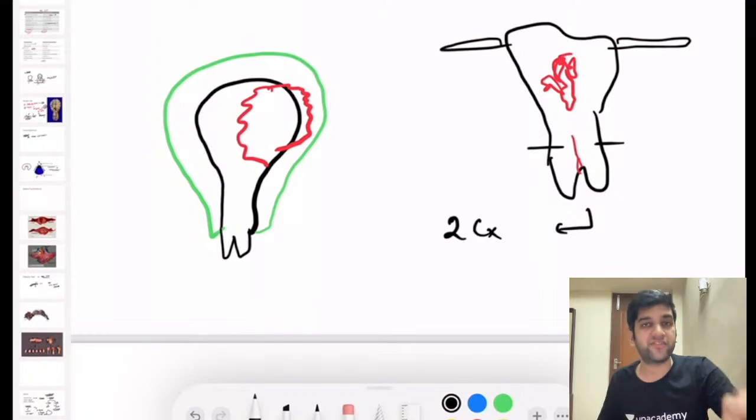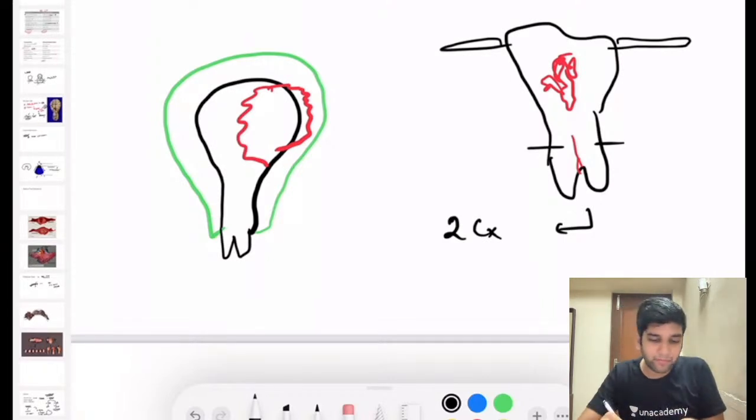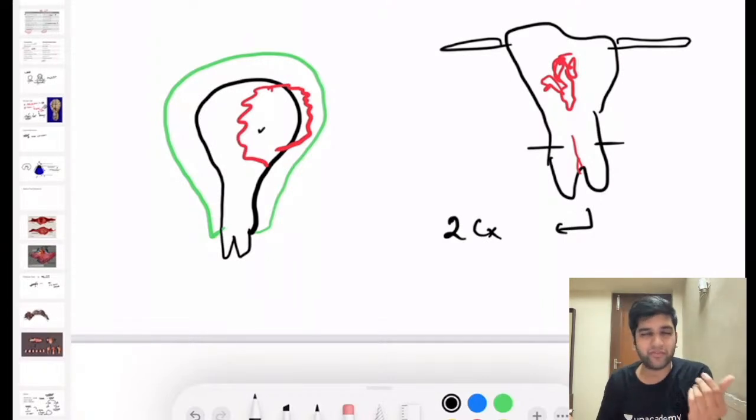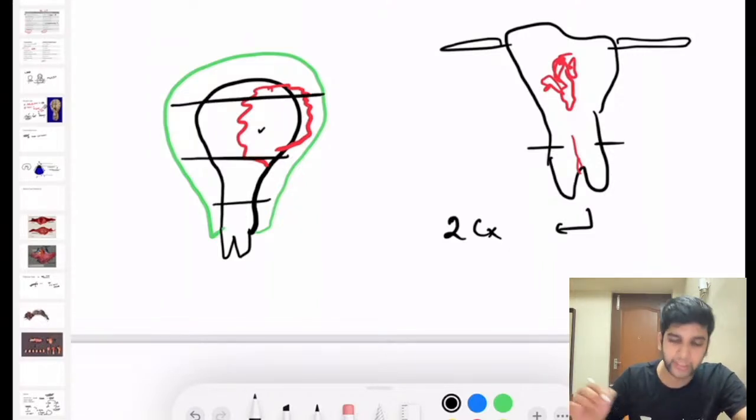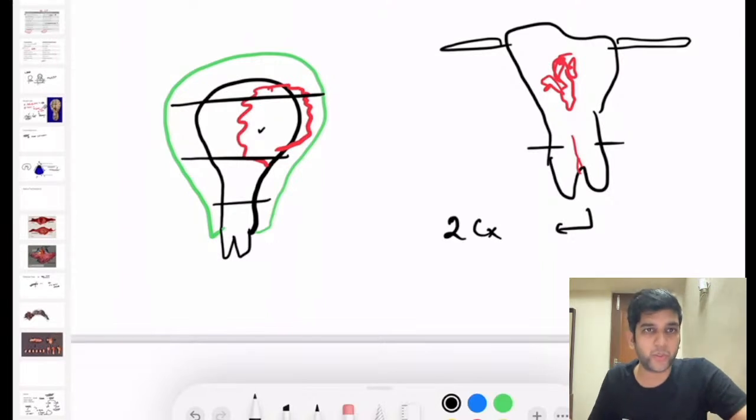This I want to do it in the first day itself, because the first day itself you can see that, and you keep it, fix it properly, so that most of the endometrial carcinomas will be very, very fragile. It might fall off. Once you fix it, it becomes a little bit firm. Then cut it and embed everything. While embedding, please make sure it will fill into a cassette. If it's not going to fill into a cassette, give more slices.